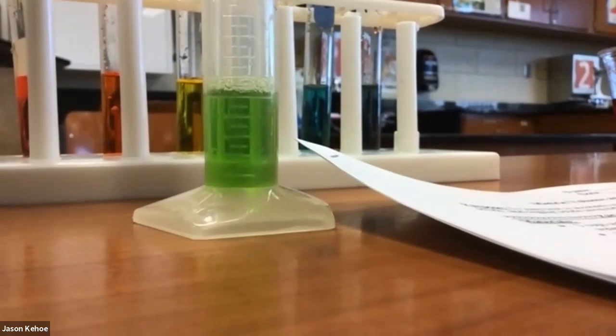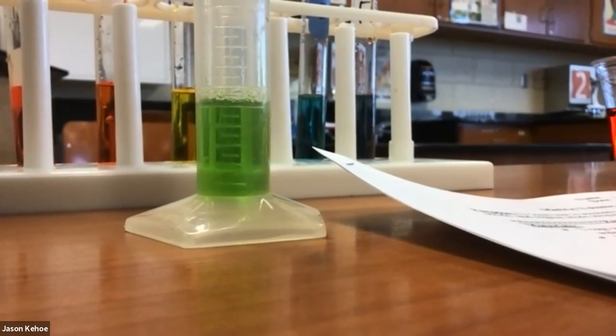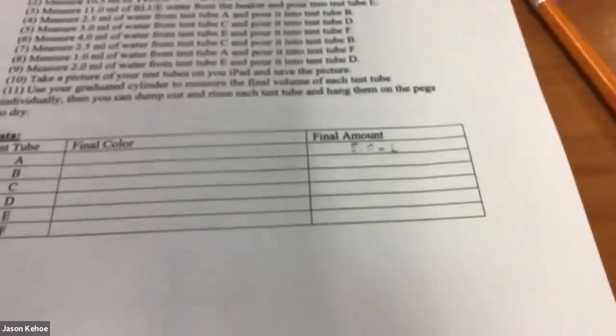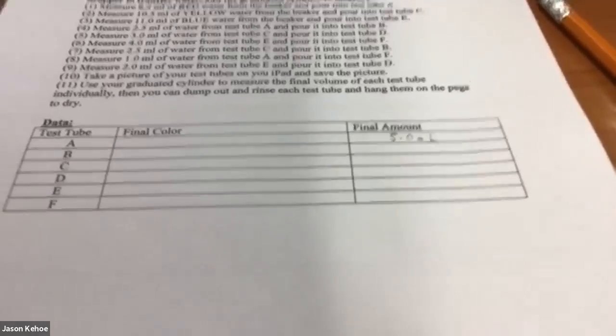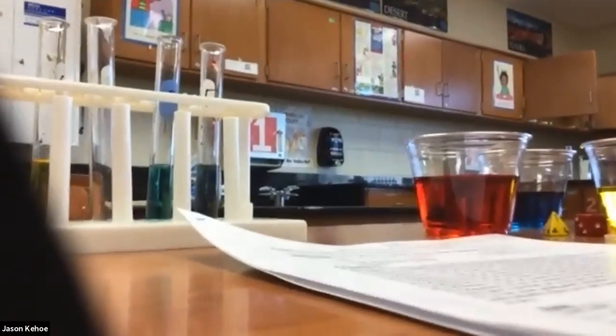I believe what it's supposed to add up to is exactly 5 milliliters. So if I took my time and did this right, yeah, this would be 5.0 milliliters. So you'll fill in that final volume. And again, you can't do this lab at home, so the best we can do is show you what it is. But you can at least see what each color is. And we've checked that they all should be 5 milliliters. Right, and there will be a waste beaker. I'm just going to pour a lot of this directly into the sink, though.